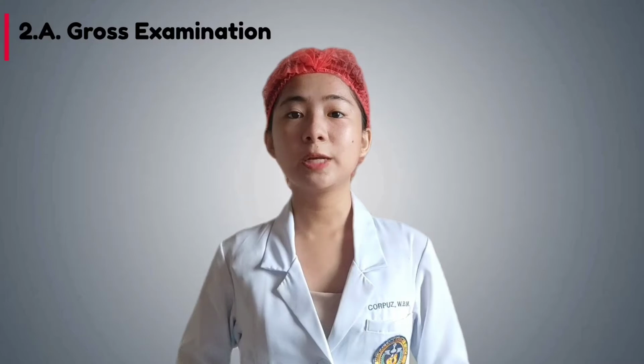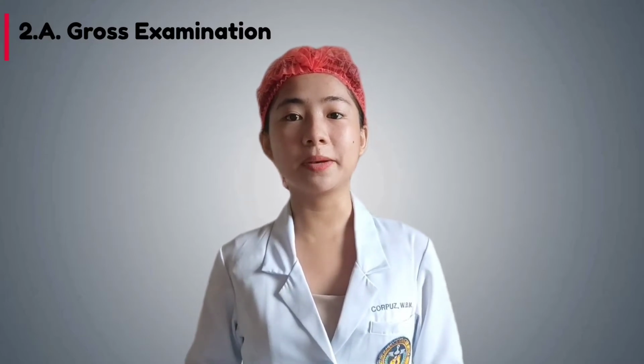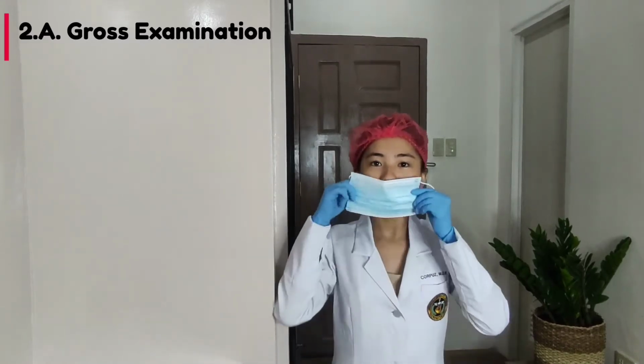In grossing, the pathologist or medical technologist inspects the specimen, describes and measures the tissue, inks it if necessary, and sections the tissue to be processed for diagnosis. We will now begin the examination proper. It is important to wear our mask.